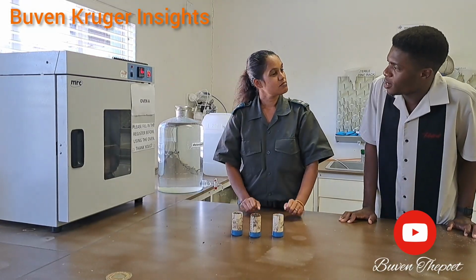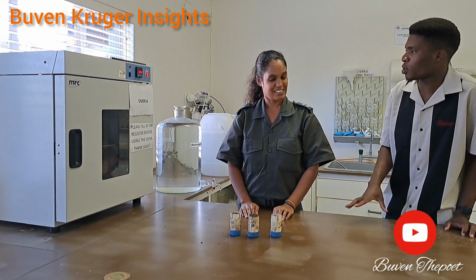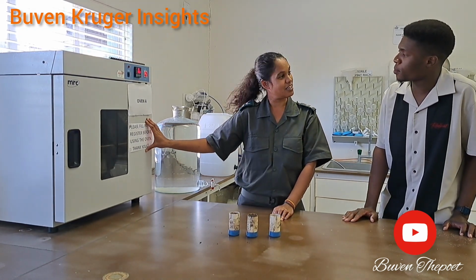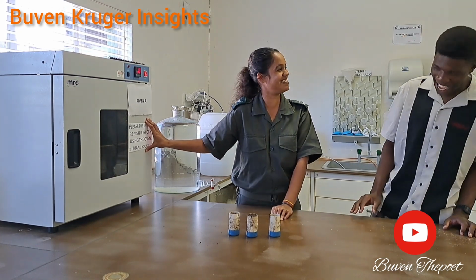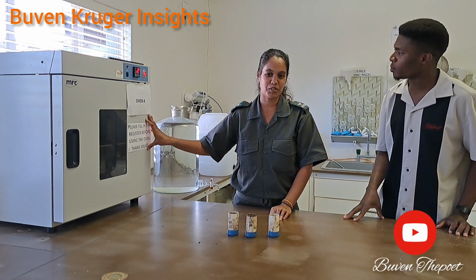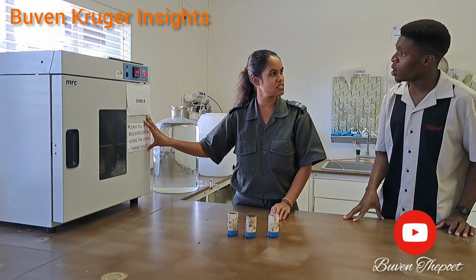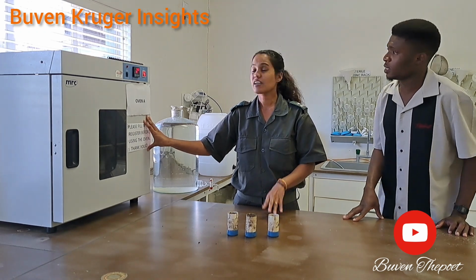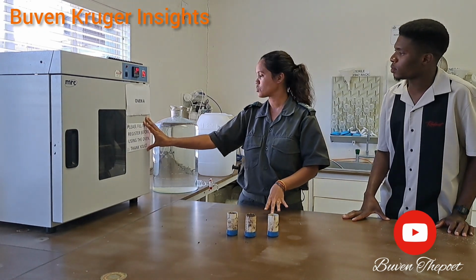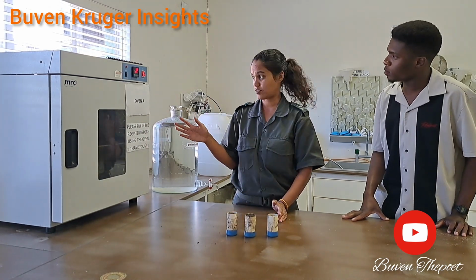Okay, so I see an oven here. Is it for the staff? Do you use it for your science projects or something else? So this is what's called a drying oven. It's not an oven to bake birthday cakes. This is the science oven. It can go up to about 200 or so degrees. Doesn't it get very, very hot? It gets hotter than your normal oven. It might go up to 600, I'm not too sure exactly. But the temperature I need is 105 degrees.